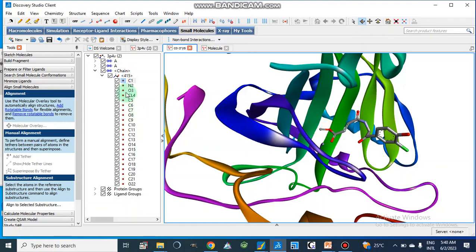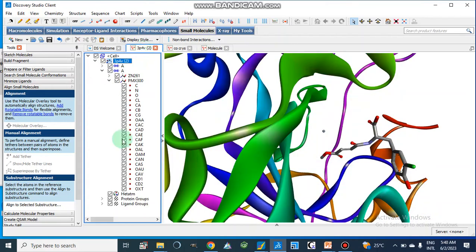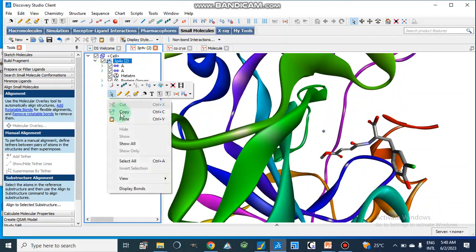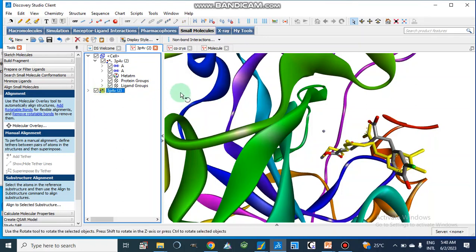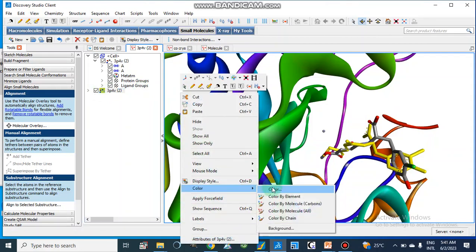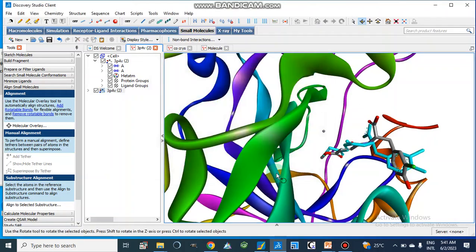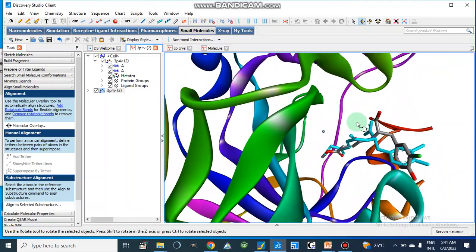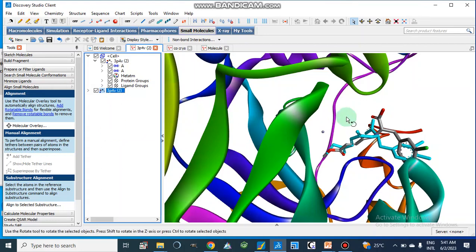When we are going to take the RMSD value, we will take this compound — we can take the whole molecule. We will copy it and paste it into this molecular window. This is our compound after docking. We can color this compound differently to differentiate both compounds — we can color only the carbon atoms. These types of tutorials are already present on my YouTube channel.